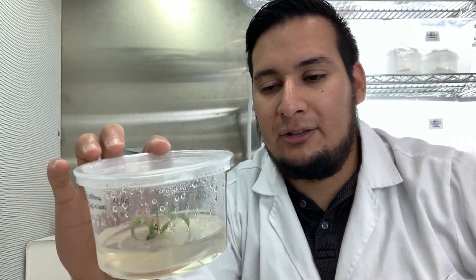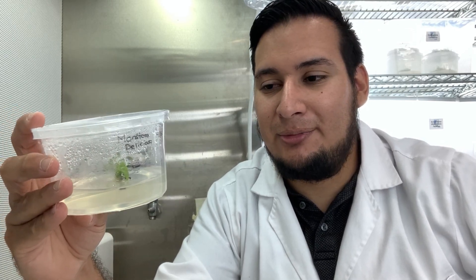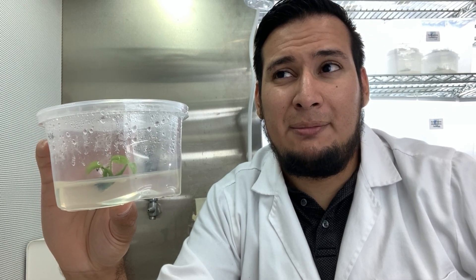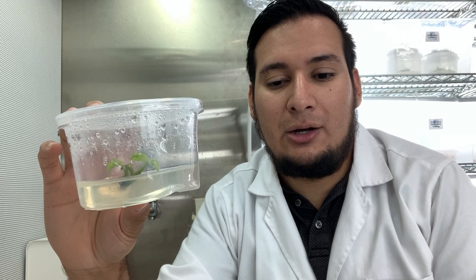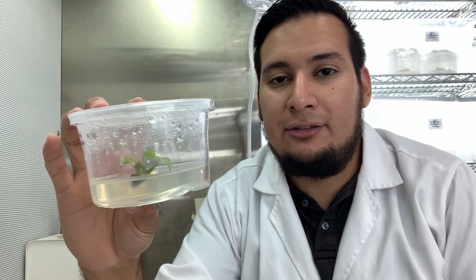Especially right now with only two plants, it's just not doing well. But contrary to what you might think from the thumbnail, I'm not giving up. I want to move it to new media. In my last update I also mentioned I placed the plant in the wrong media — I used 1 mL per liter of BA and 0.3 mL per liter of NAA, but I meant to use 5 mL per liter of BA and 0.3 mL per liter of NAA for multiplication.